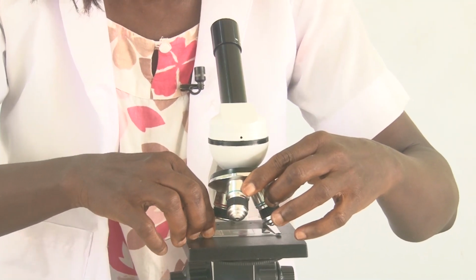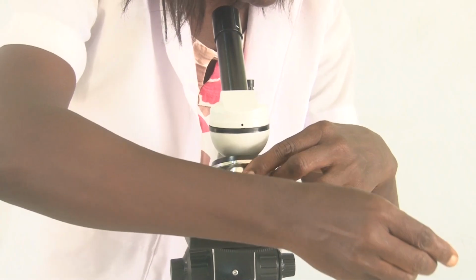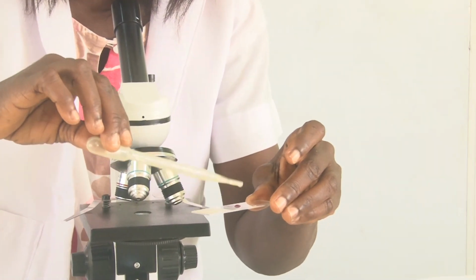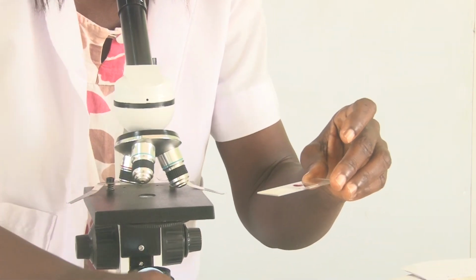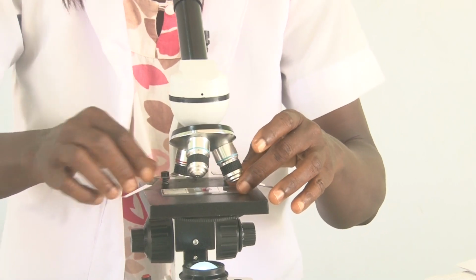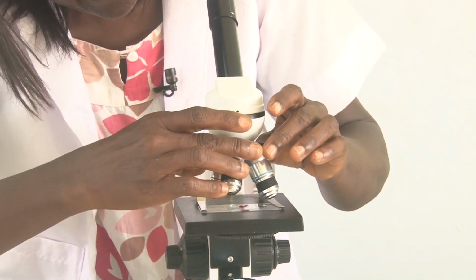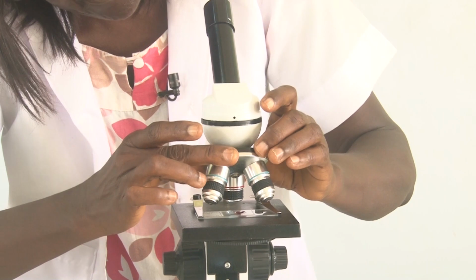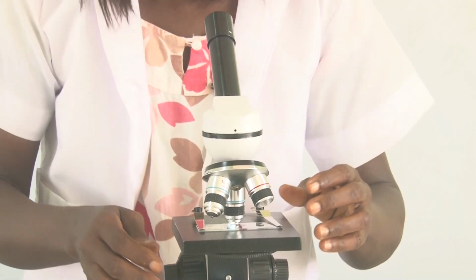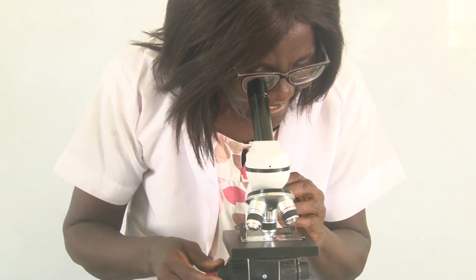Then we take the specimen off the stage, and if we have oil immersion oil, let's see, this is oil immersion oil, we put some on the cover slip, put back the specimen, and now move the oil immersion objective onto the slide and use the fine adjustment to look at your specimen.